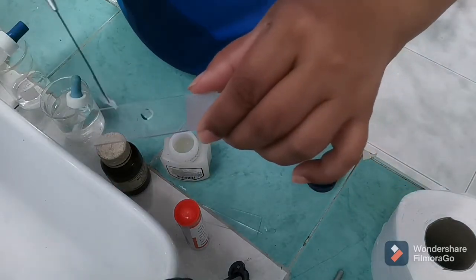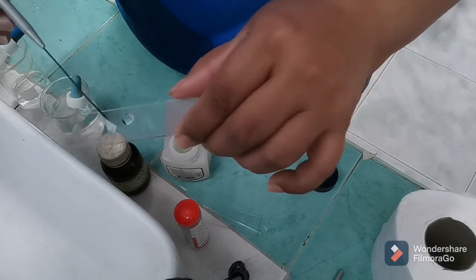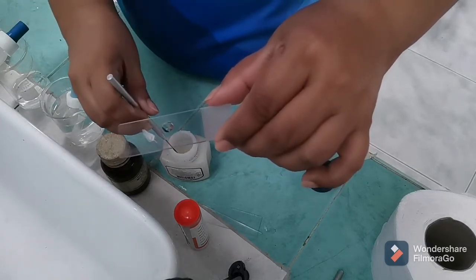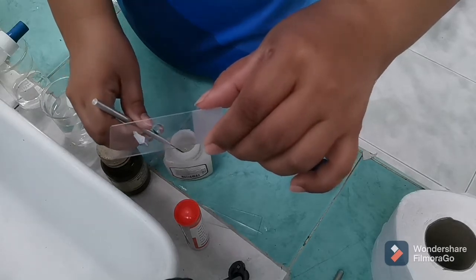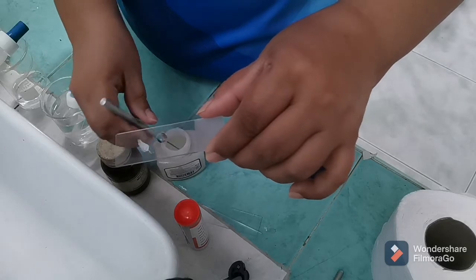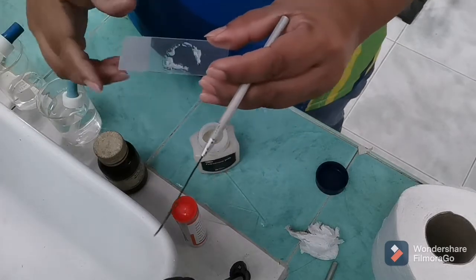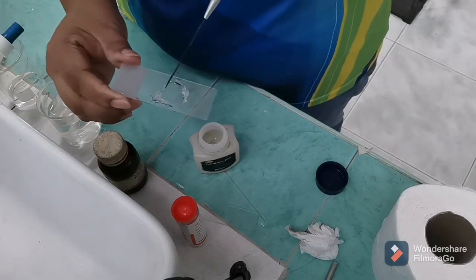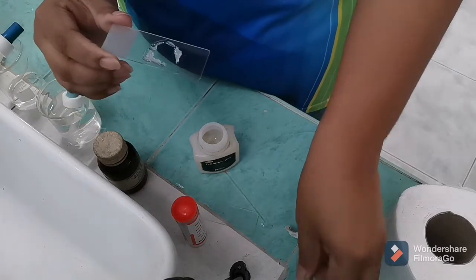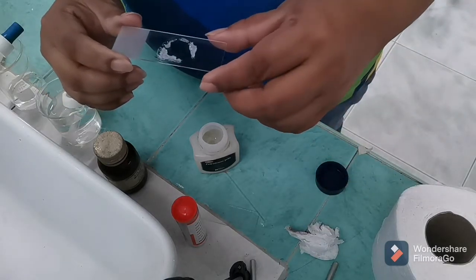But in some instances, what I usually do is just simply drop a small amount of Vaseline in some areas, not necessarily a circle, but something that could support the cover slip that I will be using. Now that I have readied the petroleum here and spread it around this area, I could proceed to the next part of the experiment.